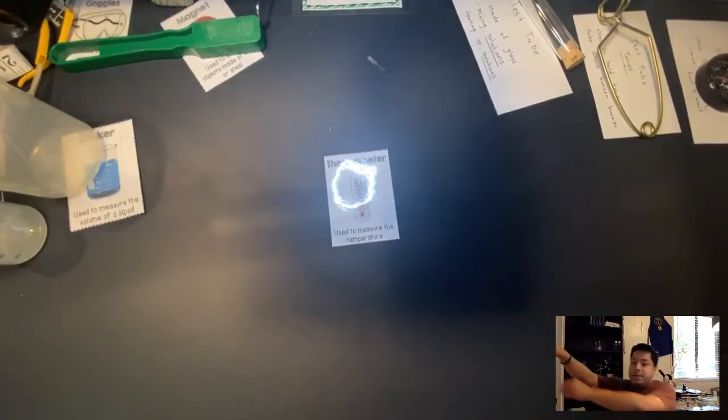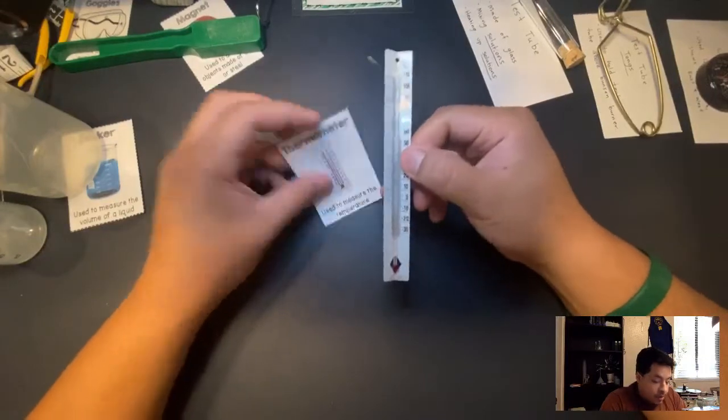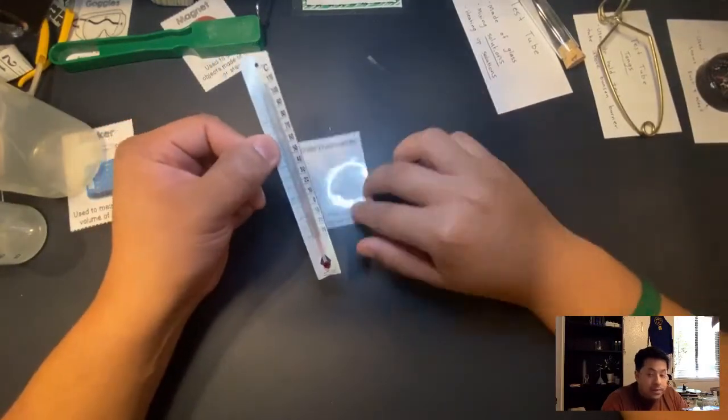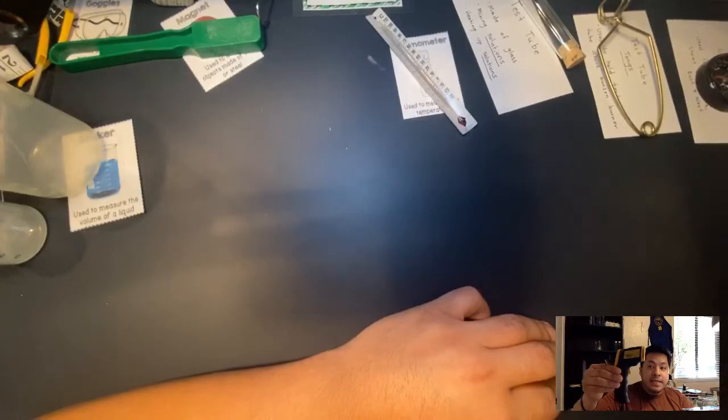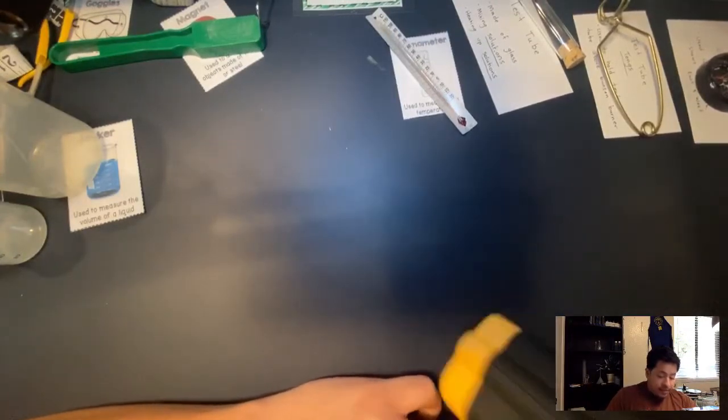Moving on — a thermometer. I have a thermometer right here on the wall. A thermometer measures temperature, and the unit we're going to be using is Celsius, not Fahrenheit. I also have an infrared laser thermometer — you point the light at someone's forehead to check their temperature.